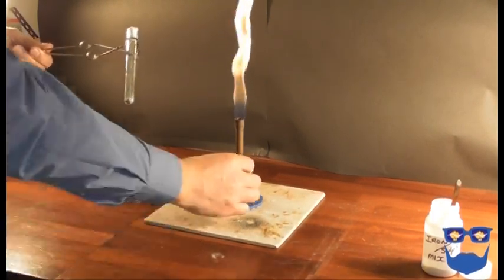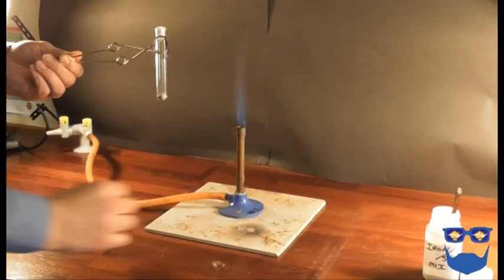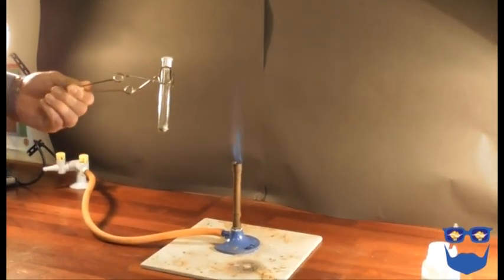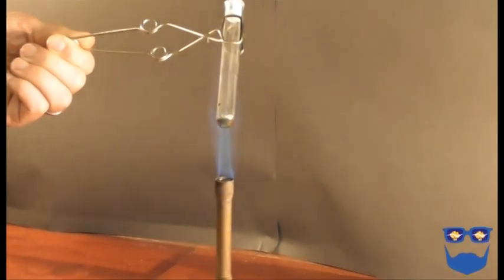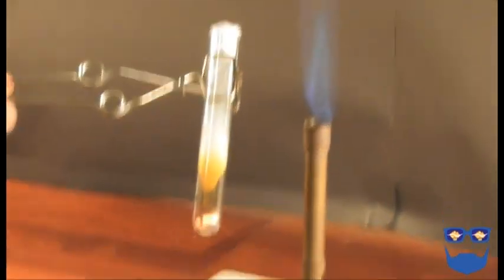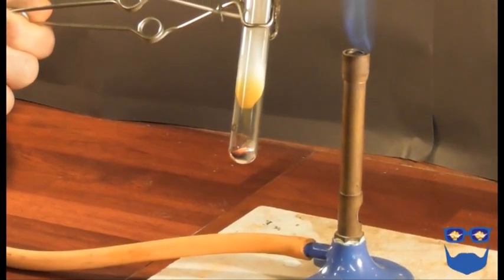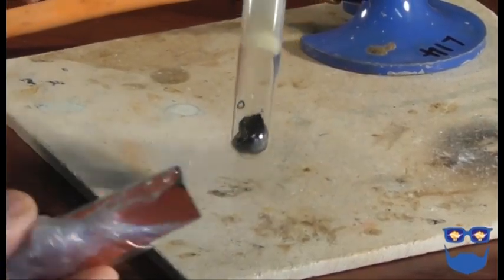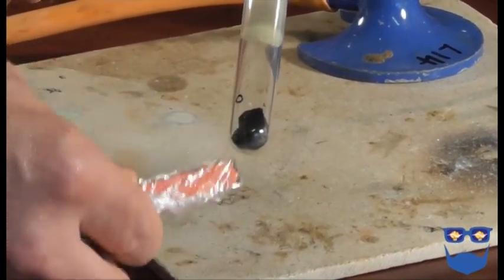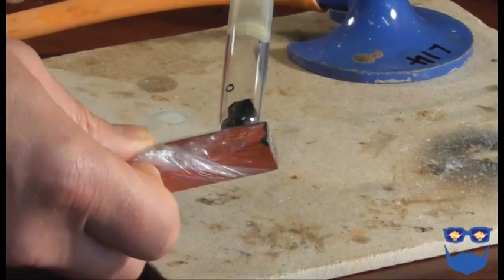Heat the mixture strongly with a blue flame until you see a chemical reaction start. Remove the test tube from the heat. You should observe the mixture continue to glow as the iron and sulfur react. Let's do it.